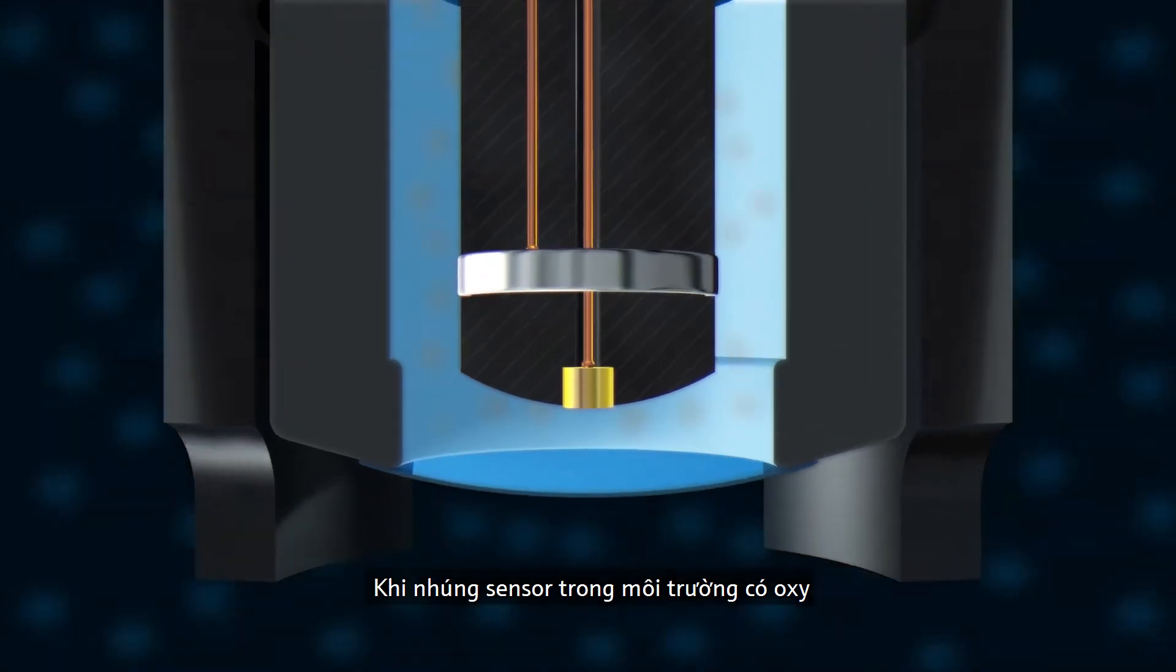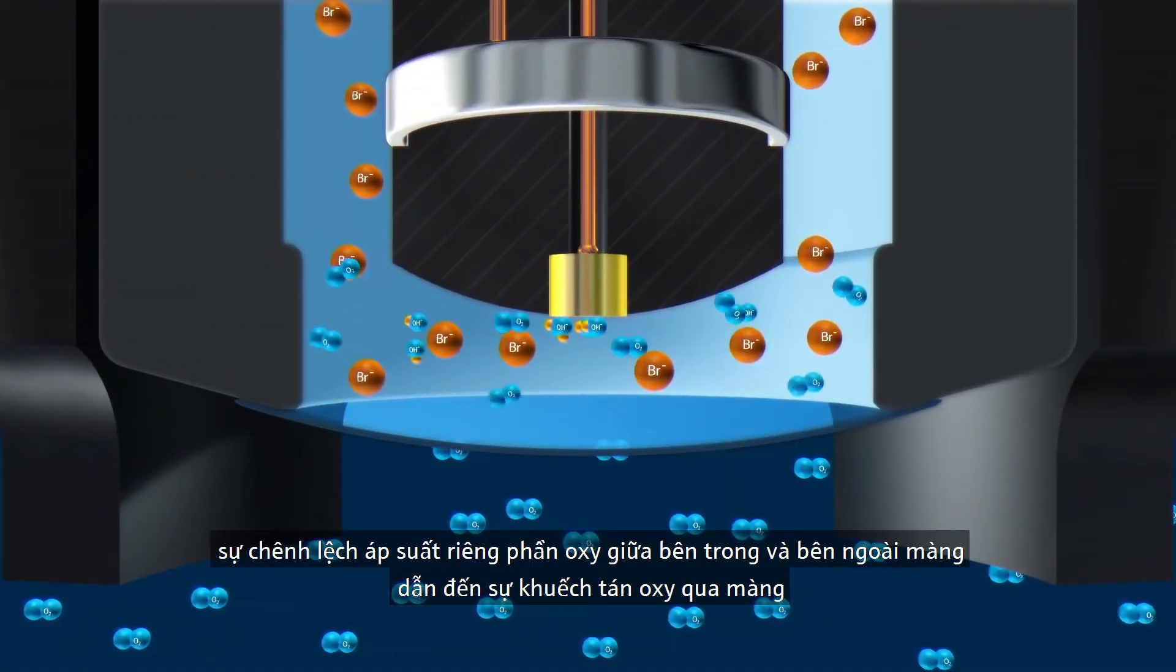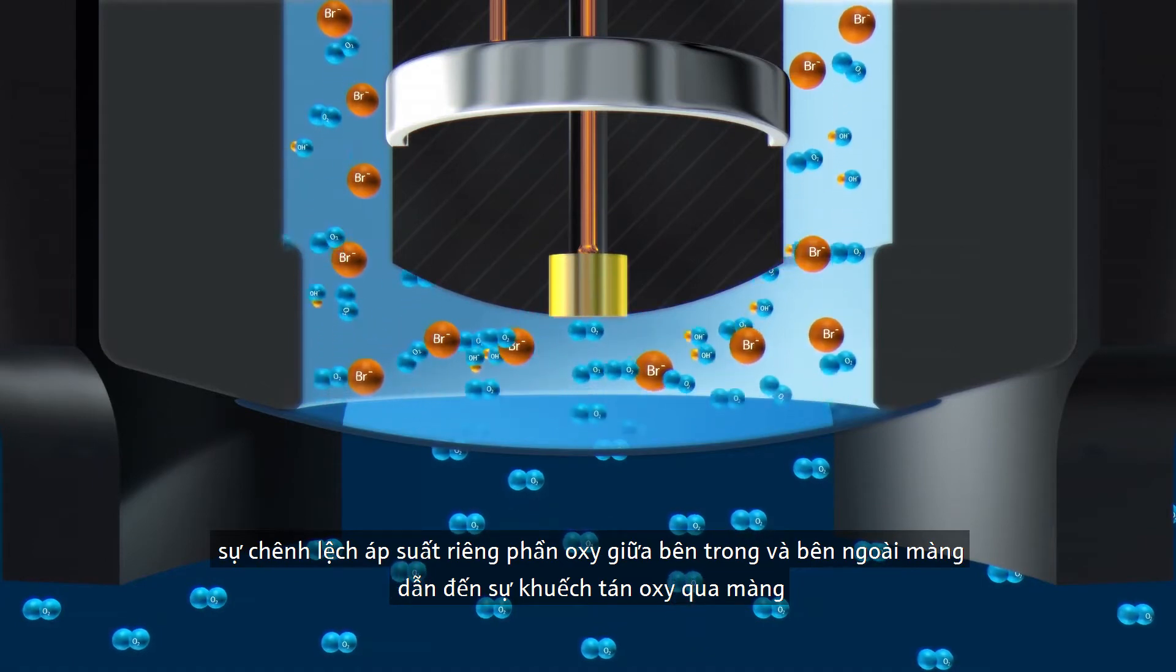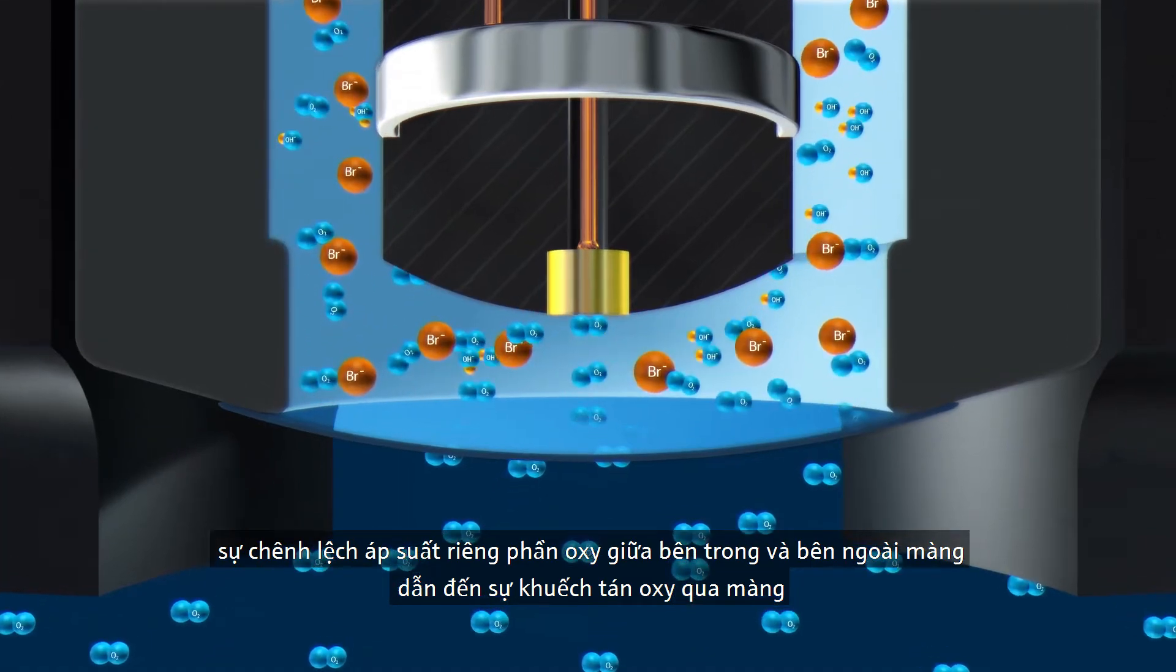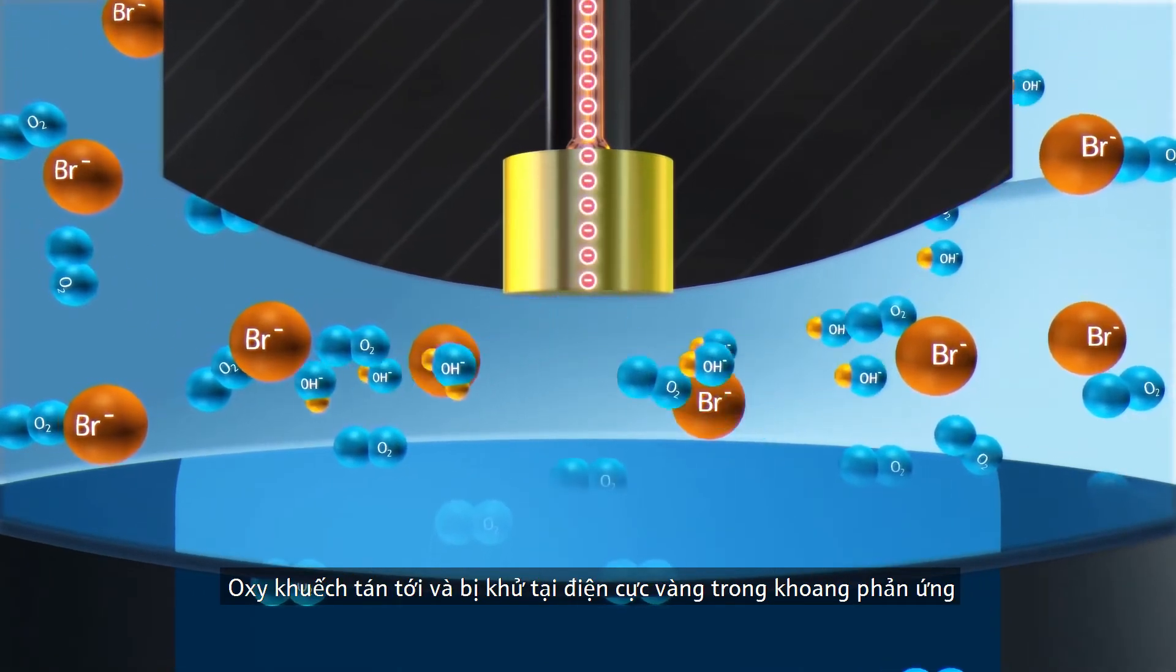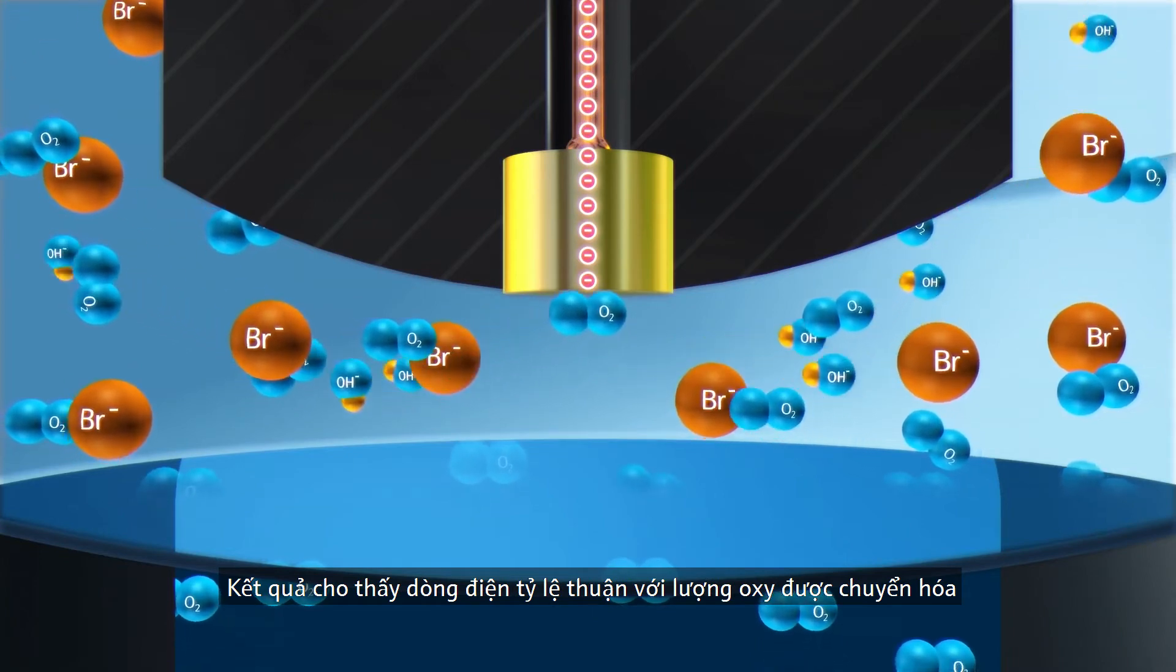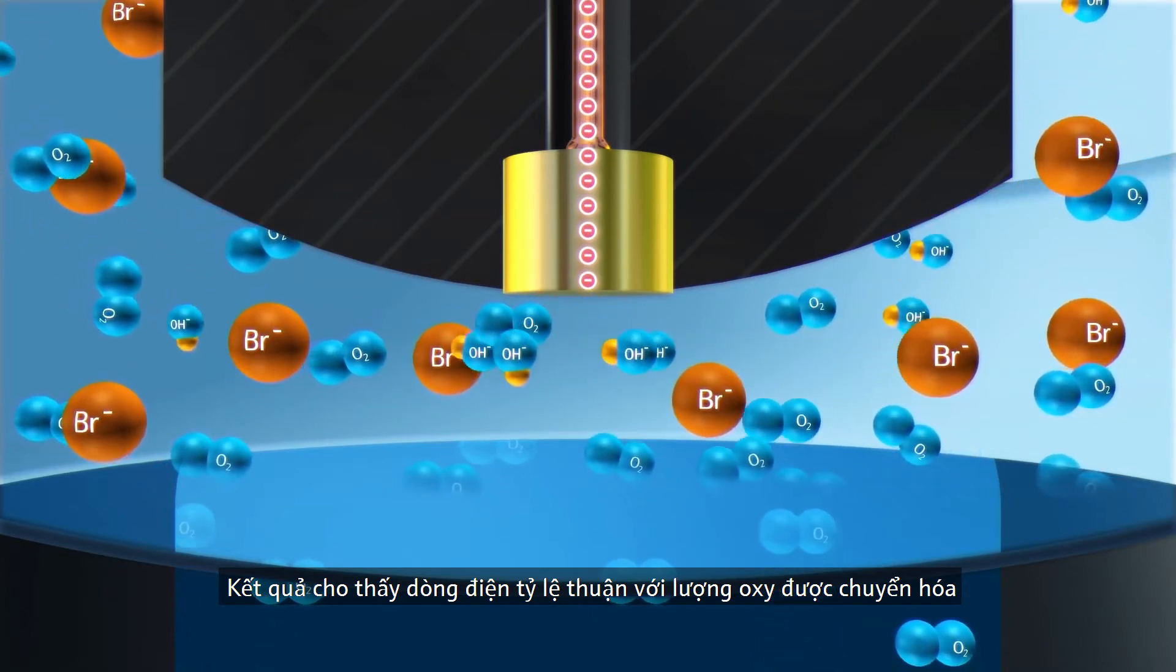When the sensor is immersed in a medium containing oxygen, the difference in the partial pressure of oxygen between the inner and outer membrane walls leads to the diffusion of oxygen through the membrane. The diffused oxygen is reduced at the gold cathode in the reaction chamber, resulting in a current flow that is proportional to the amount of transformed oxygen.